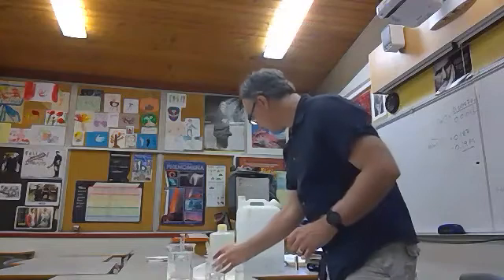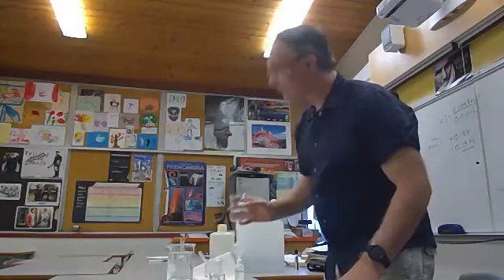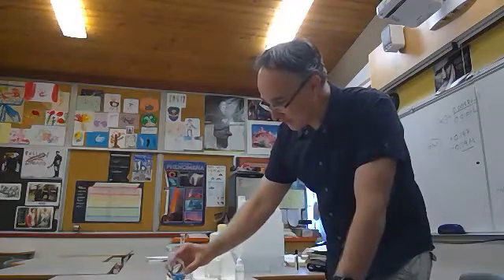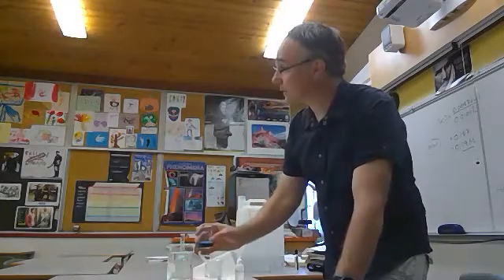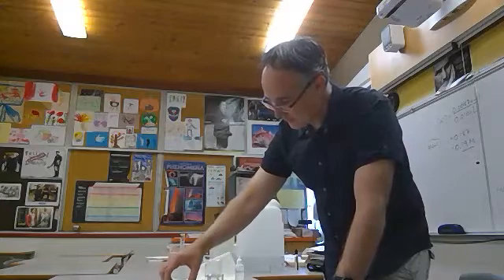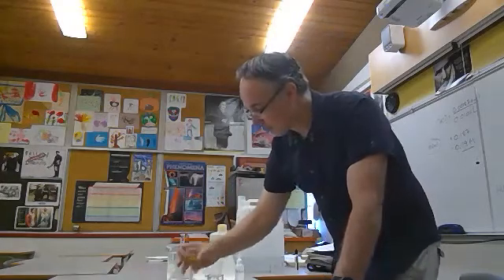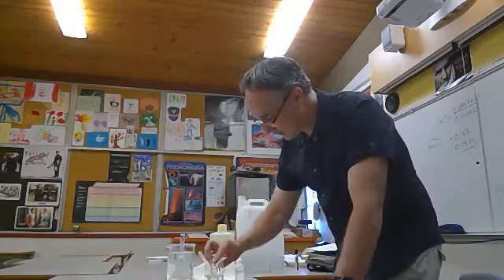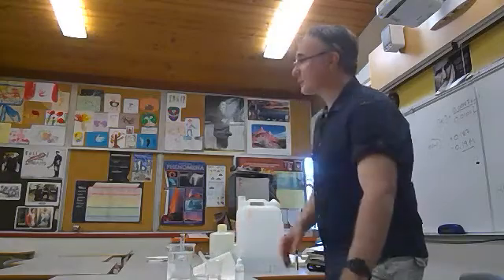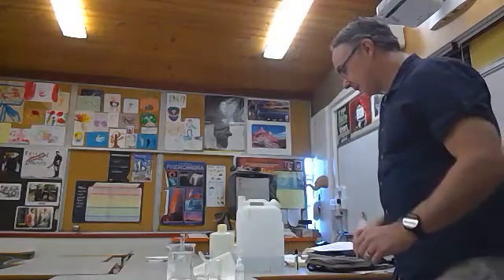And then the base, this is the sodium hydroxide we use in the titration. Just pour a little bit in there. And quite blue now, right? And then you can kind of mix them, pour them together. It kind of neutralizes it, right? So it's neutralizing it. Still neutralizing it, right? So it just takes a bit of time to neutralize it. We can maybe pour that in here, but it's still blue. Well, maybe light blue. And that would have meant there probably was more hydroxide present in total, really.